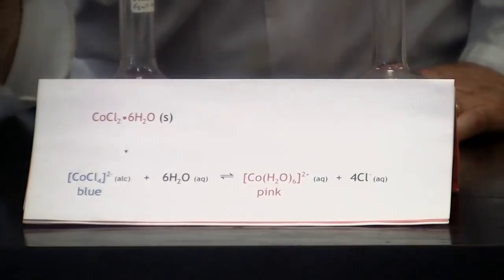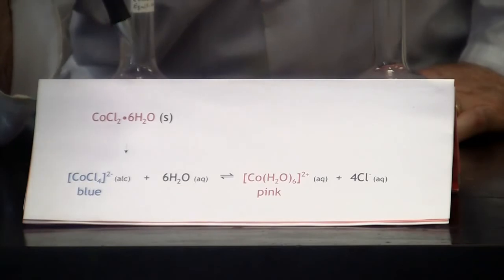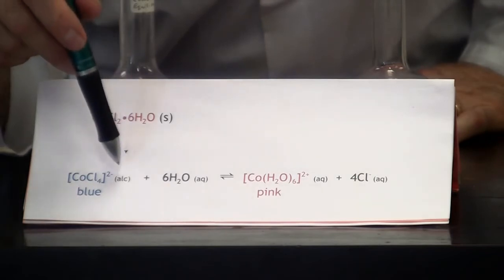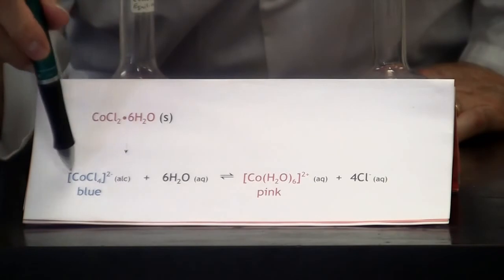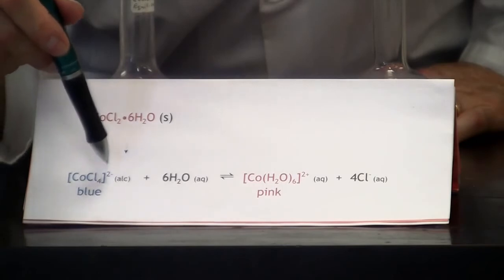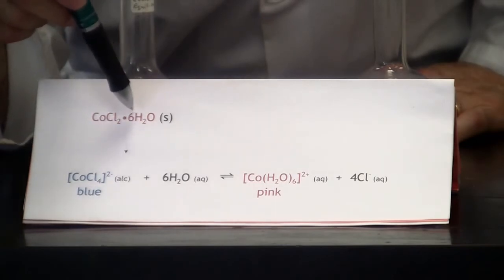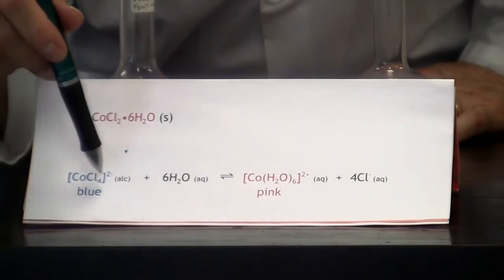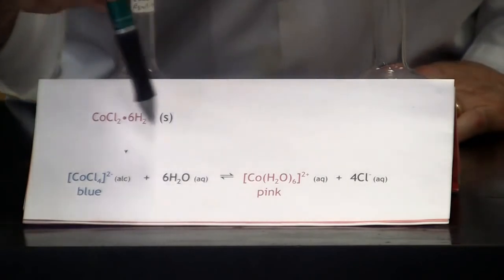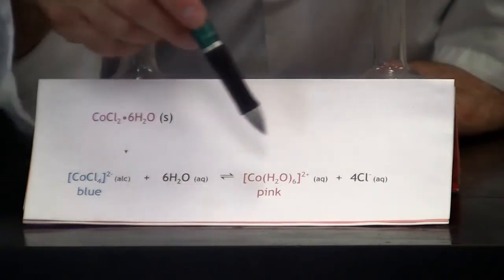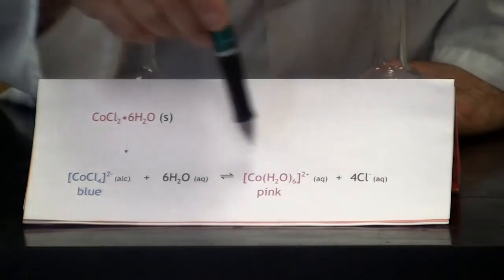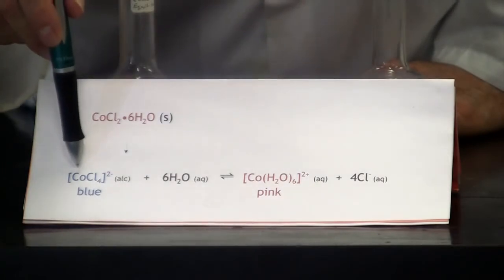Now here is an interesting solution to our problem in the first demonstration. Instead of dissolving the cobalt chloride in water, we dissolve it in alcohol, and by doing that we get a nice blue color. Presumably the alcohol removes this small amount of water by hydrogen bonding, allowing the chloride ions to surround the cobalt giving us this nice blue color. According to Le Chatelier's principle, if we add water we'll shift the equilibrium to get the pink color, and by adding a chloride ion we'll shift it back to get the blue version.